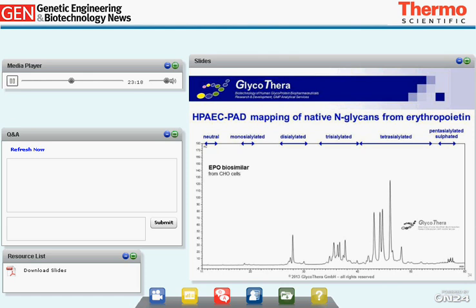Starting with the main glycan group, the tetrasialylated N-glycans, the following glycan structures were identified. The main signal peak corresponds to tetrasialylated tetraantennary with proximal fucose. Then we find tetrasialylated tetraantennary N-glycans with 1 LacNAc repeat. 2 isomer structures were detected with 2 and with 3 LacNAc repeats.